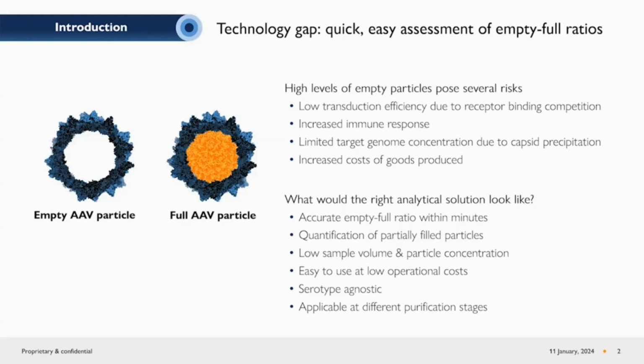That high level of empty particles is due to the fact that there is a gap in a good quantitative, accessible analytical tool that allows characterization of the AAV samples at early stages.